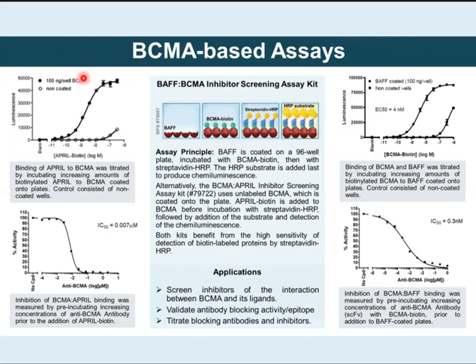So these assays are particularly useful to screen for inhibitors of the interaction between BCMA and these ligands, to validate blocking antibodies, or to titrate antibodies and inhibitors, as illustrated in these two examples.